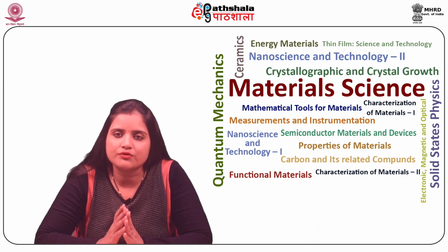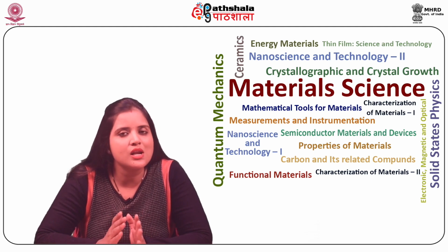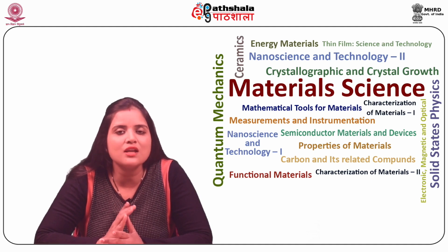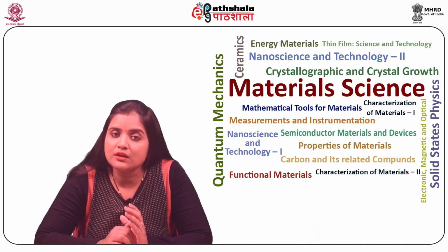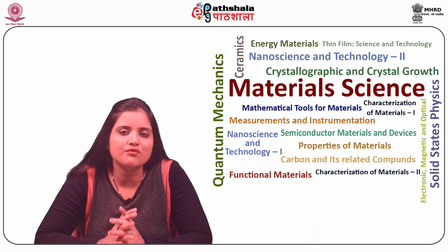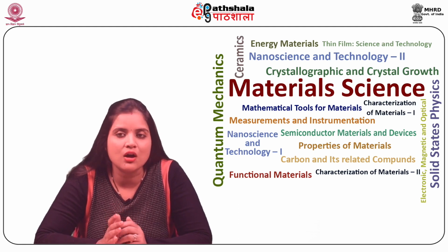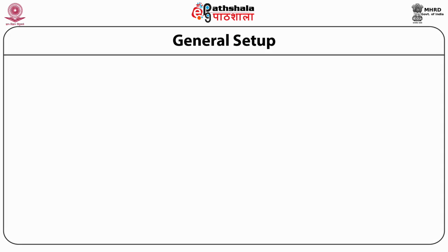The dynamics of the molecules, the local environment of the molecules, the polarization dependence of emission, and thereby the orientation of the dipole moment of the molecule, photo-bleaching, etc. have been investigated.